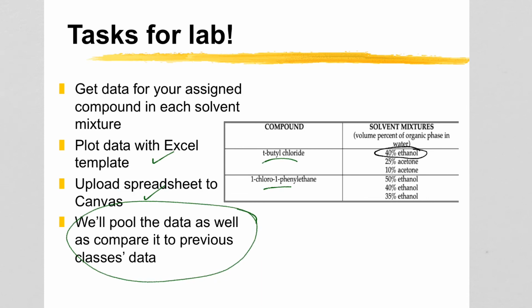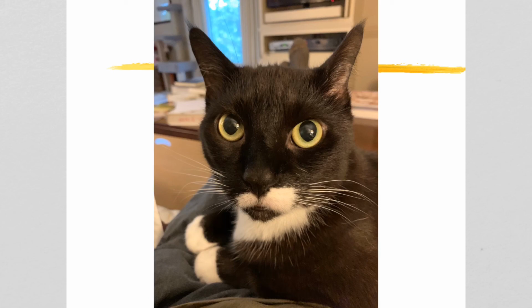So that's about it. Dudley wants to remind you to be very focused during lab because you need to read the burette very accurately.